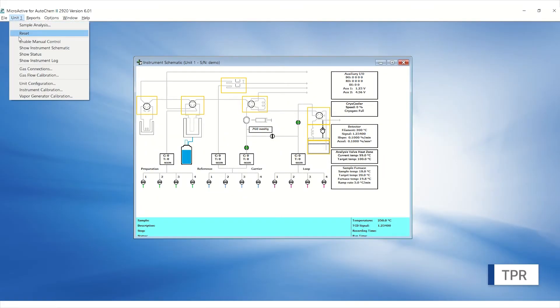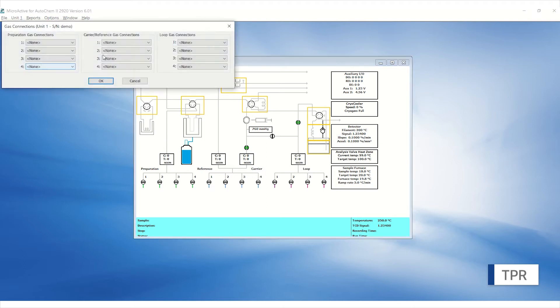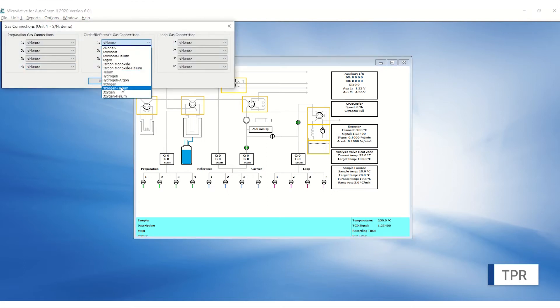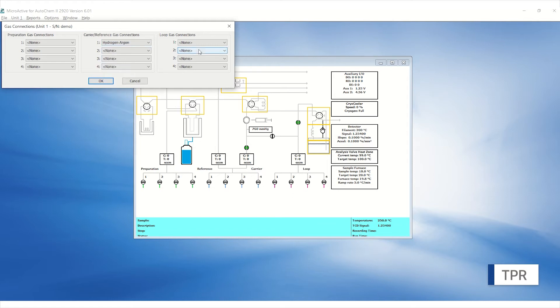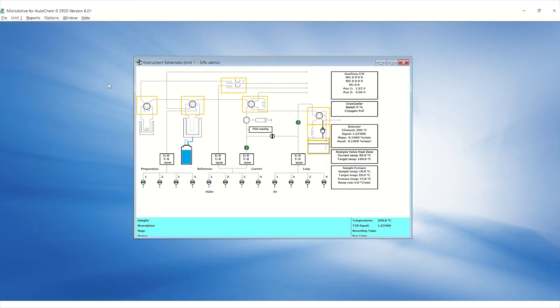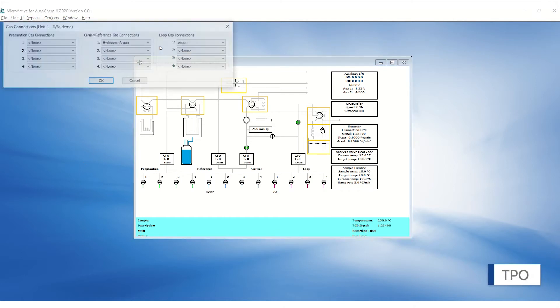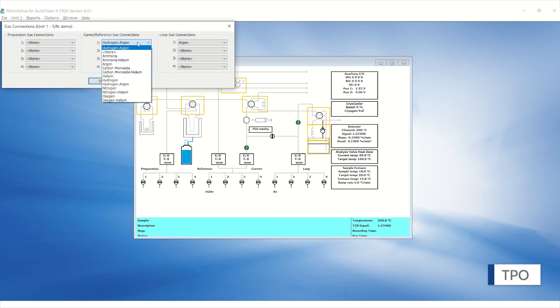For TPR, the active gas, usually hydrogen blended in argon, is connected to the carrier and an inert gas like argon is connected to the loop. The TPO has a similar setup with oxygen blended in helium connected to the carrier and helium connected to the loop.